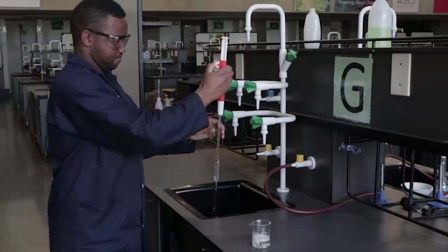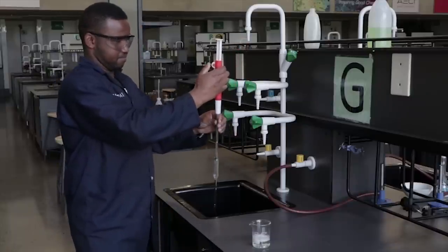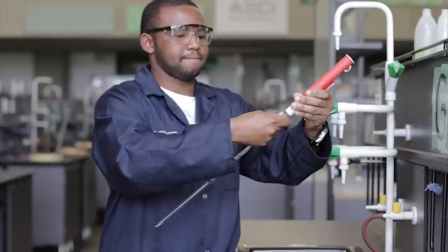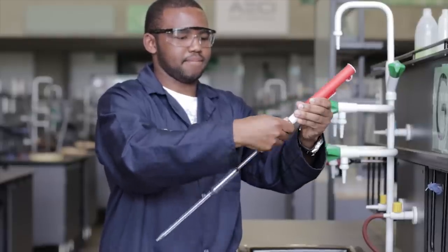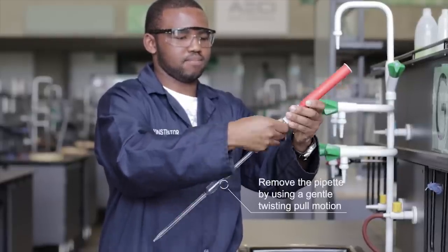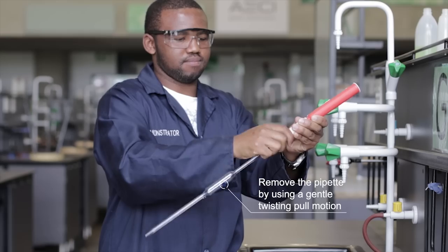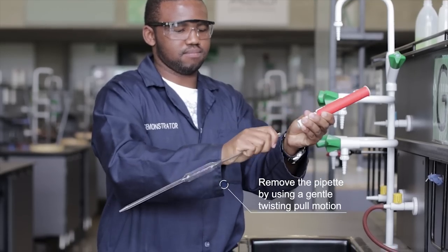The cleaning solution is then run out of the pipette into the sink. This procedure is repeated two more times. At this point, the pro pipette is removed by loosening the white end that was tightened earlier and the pipette is removed by using the twisting motion.